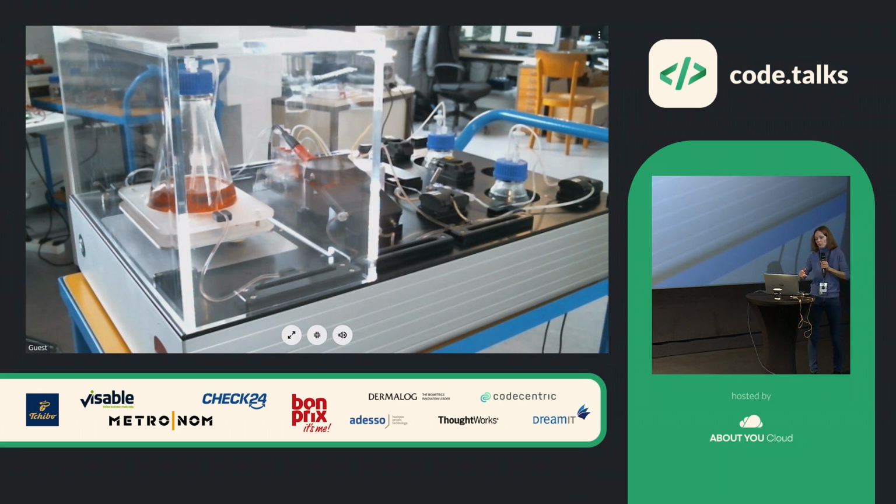So by default we always save our data on a Raspberry Pi inside. We save the data on the Raspberry Pi, and when there is internet connection, the Raspberry Pi uploads the data to the cloud. If the internet connection is not there, it just stores the data. And the SD card is so big that you would really need to not have internet for many days before you run into trouble. So that's what we do.